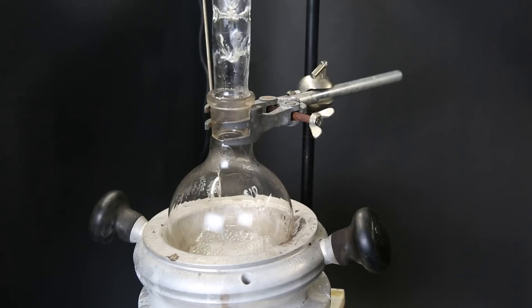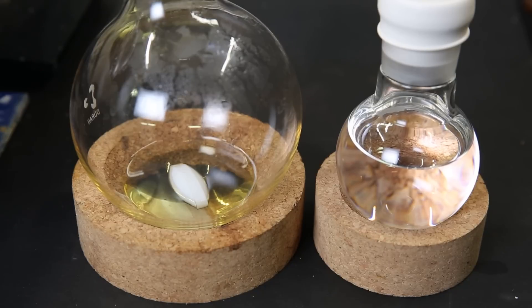After it had been running for a few hours, I collected enough in the receiving flask. So here we can see the remaining now yellow liquid on the left, and on the right, the fresh clear cyclopentadiene. For now, I will set it aside in the fridge and start preparing the next reactant for the ferrocene synthesis.